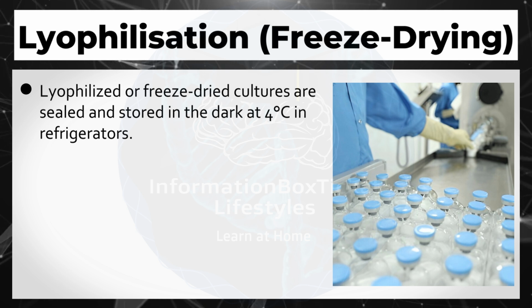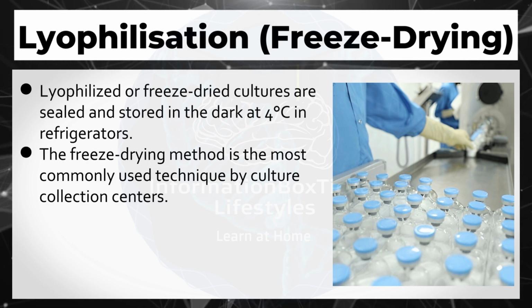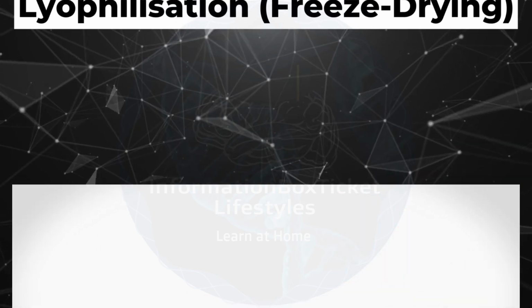Lyophilized or freeze-dried cultures are sealed and stored in the dark at 4 degrees Celsius in refrigerators. The freeze-drying method is the most commonly used technique by culture collection centers.